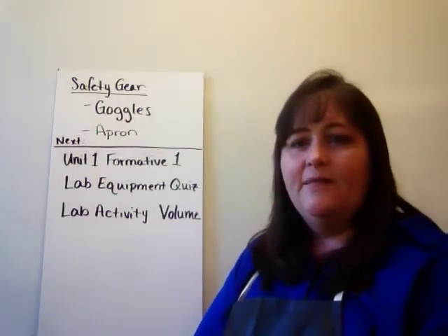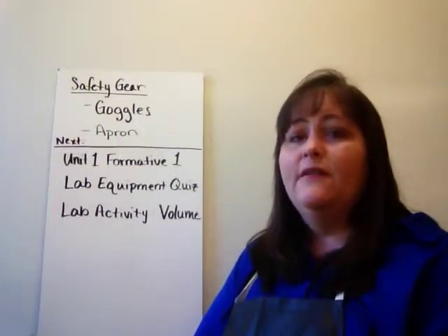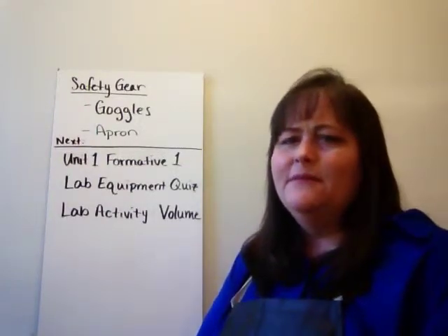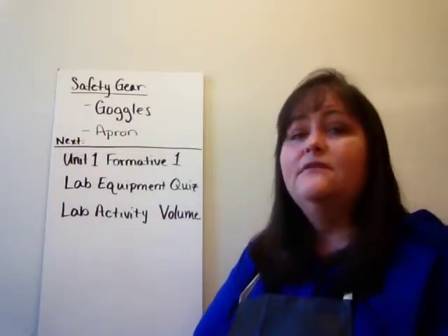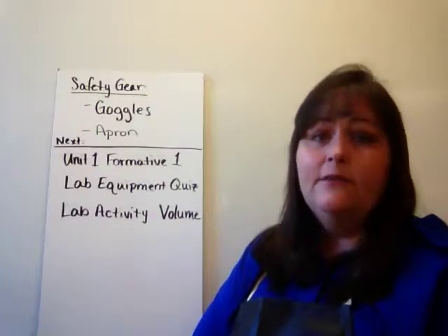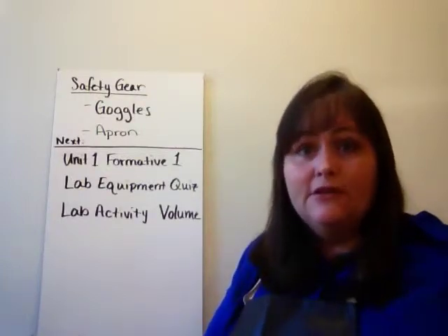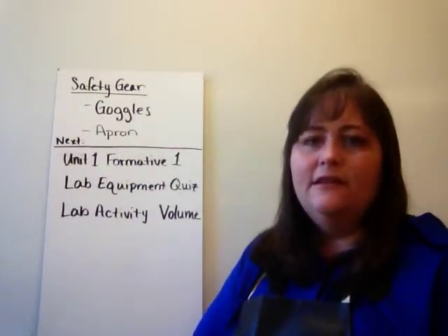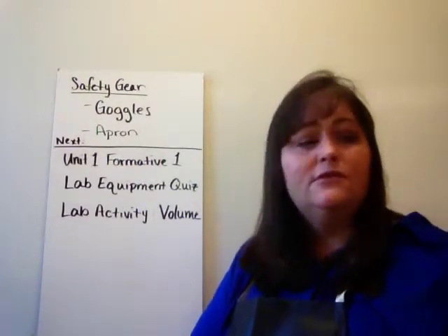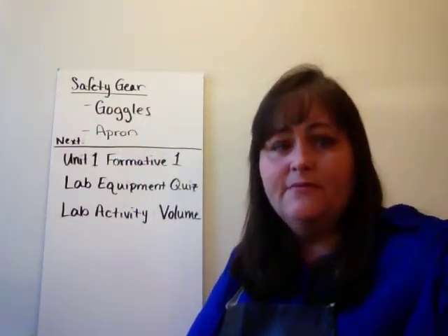You'll go into the lab and you'll measure the volume of an irregularly shaped object. What does that mean, Ms. Skinner, irregularly shaped object? Well, if you were measuring the volume of a box, you would measure the length, the width, and the height, and multiply together. There's your volume. But you're not going to do that. You're going to have something that's not a box that you'll have to use the graduated cylinder to measure.